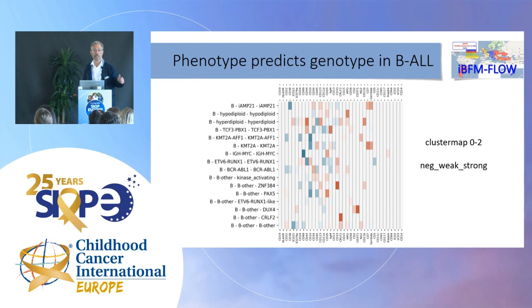Also a very typical situation. When it has CD10, it's a normal CD10-positive leukemia, but for example, CD9 very low, always pre-B, so a B3 phenotype. So it's a very classical situation. Or hyperdiploid. You will find hyperdiploid by expression of CD123, CD86. So you have markers really to inform what to do.